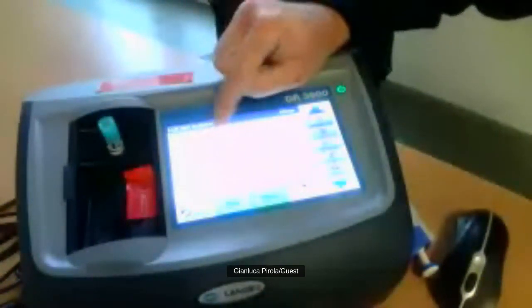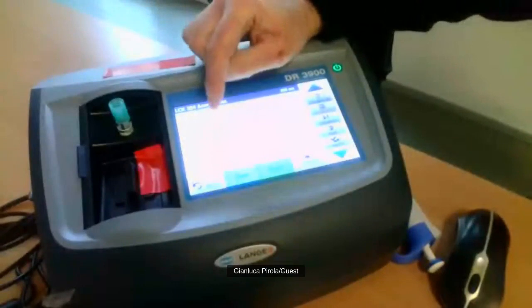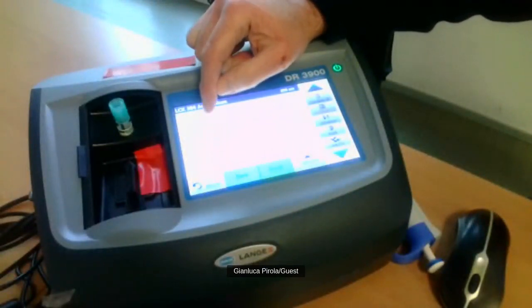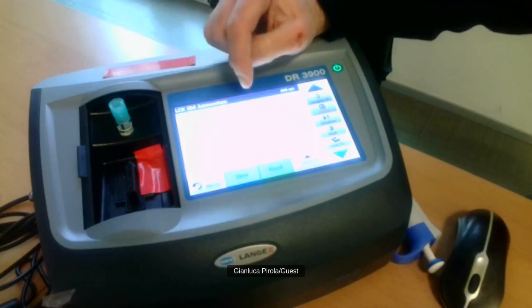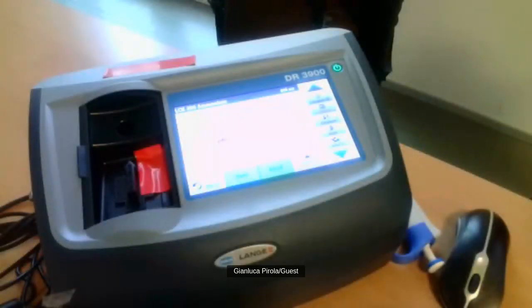When we have a result in red, I don't know if you can see it, it is in red. This means that we are out of range. It could happen that you could have a negative result. Of course, physically, a negative result doesn't mean anything. When you have a negative result, it means that the concentration of ammonium, in this case, is lower than the lower limit of the method. This is just to show you how it works.